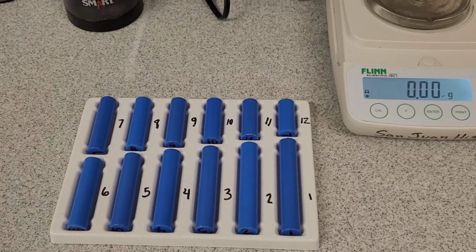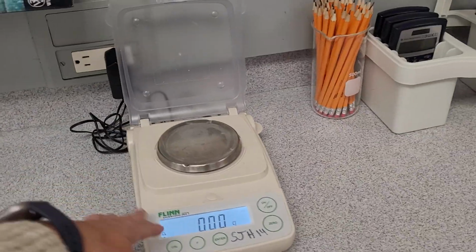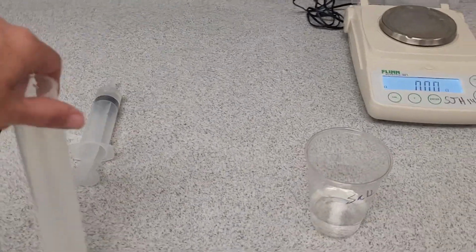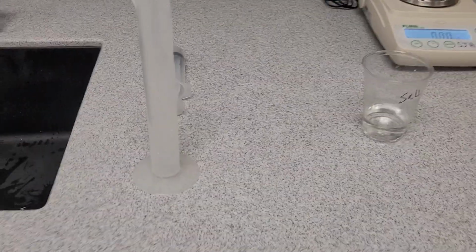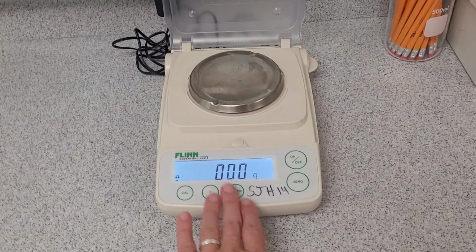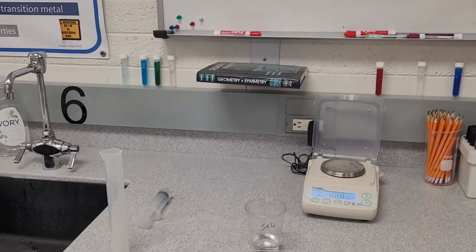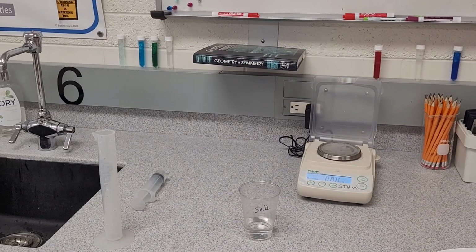It forces you to make sure you can use these supplies. So again, the electronic balance, the graduated cylinder, and making sure that you're making accurate measurements. So you can measure to tenths with the graduated cylinder, and you're measuring to hundredths with this balance. Okay, hopefully you can work hard and get all 12 done and graphed. Thanks.